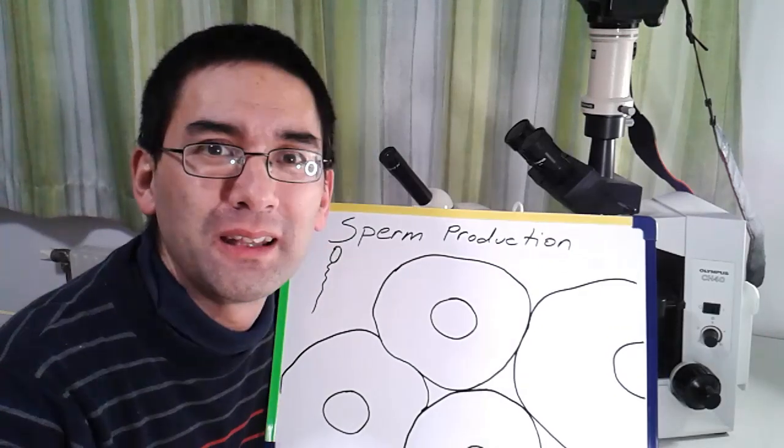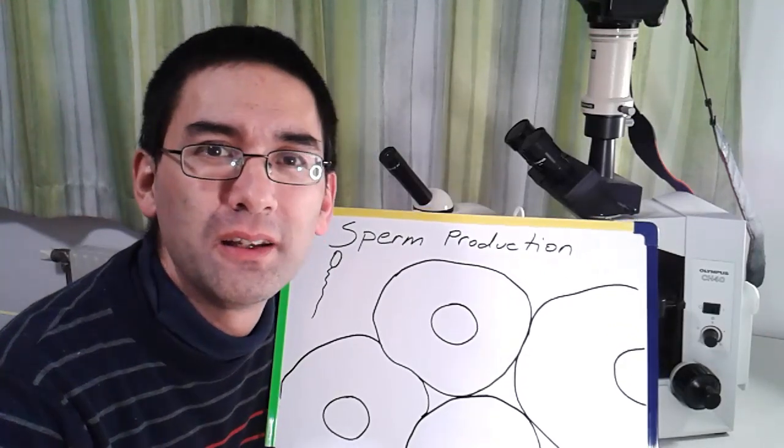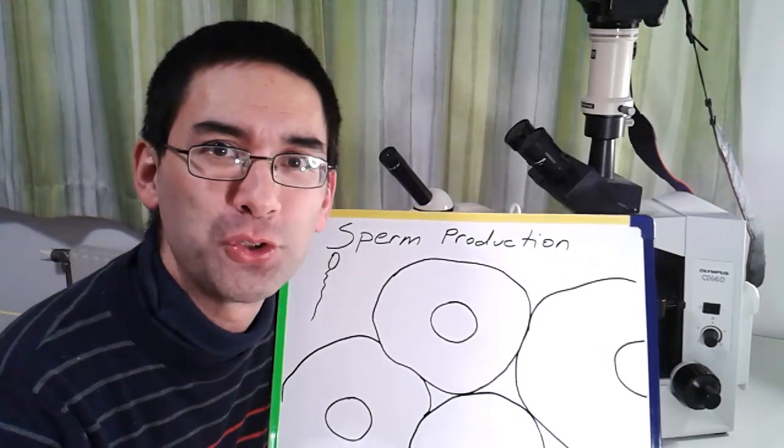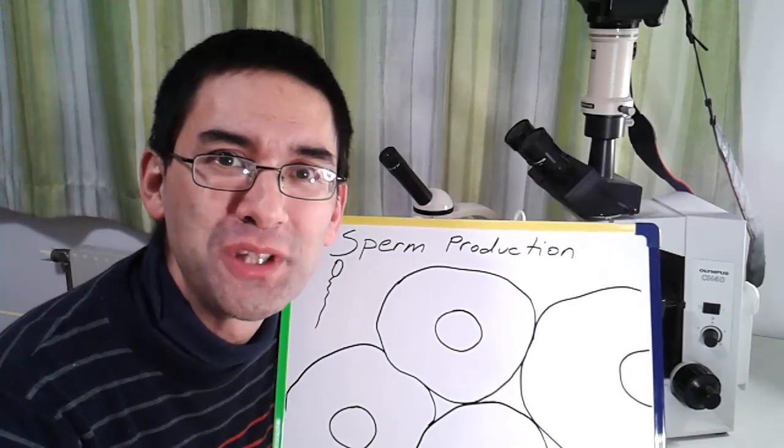Hello and welcome. Today I'd like to show you a slide with the cross-section of testis tissue. So we're going to have a look at sperm production, how sperm cells are produced in mammals.